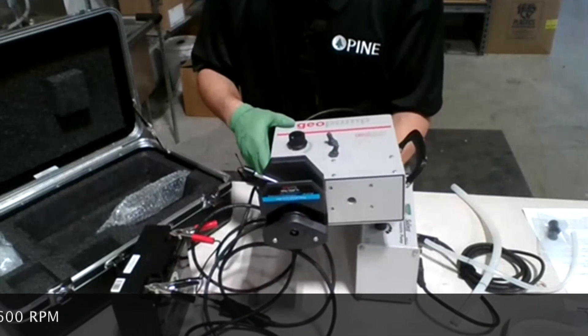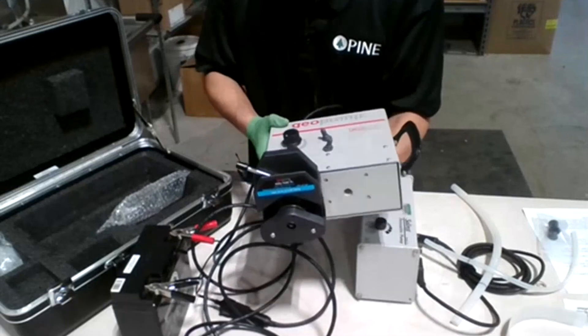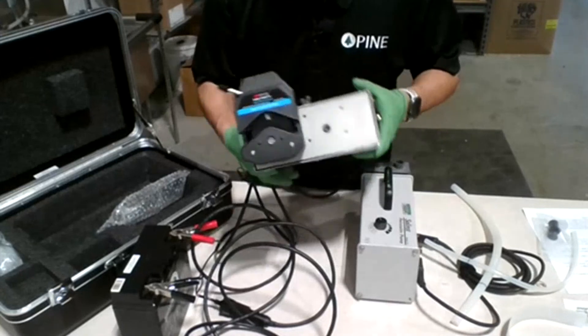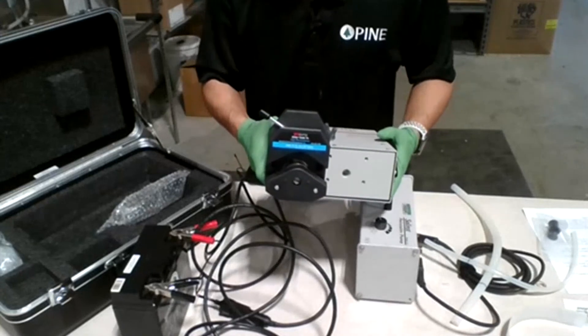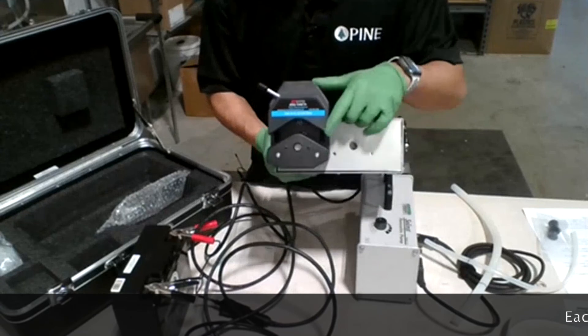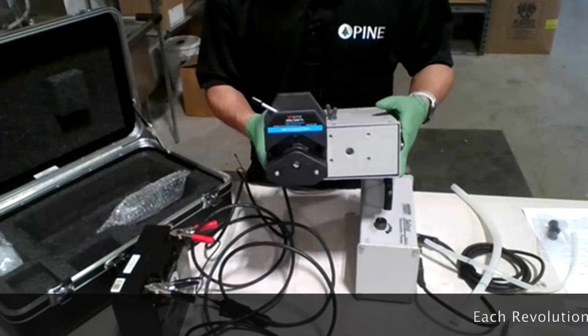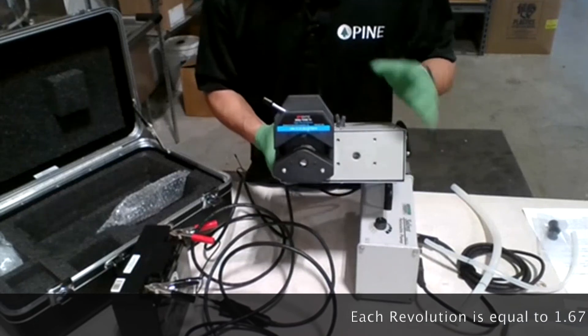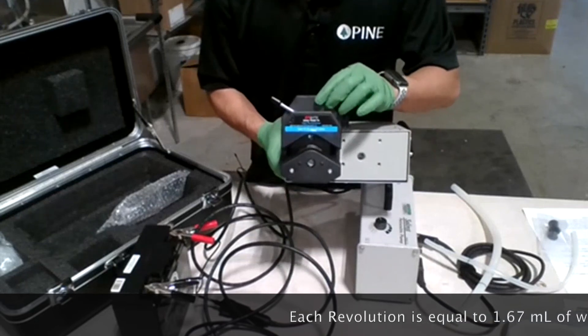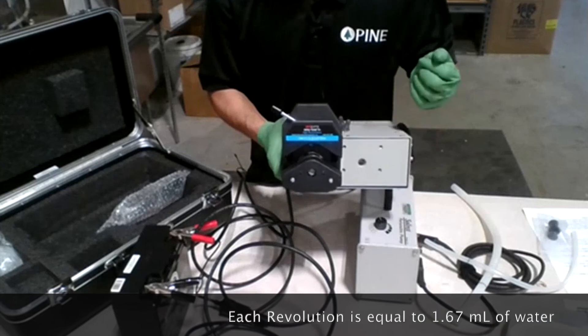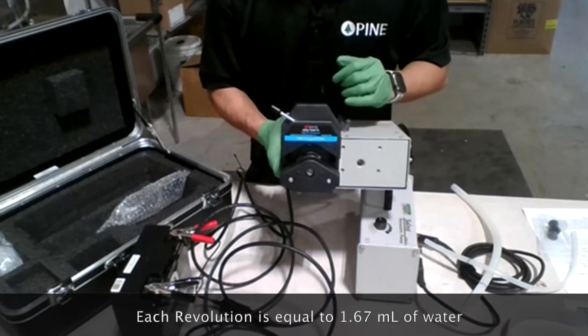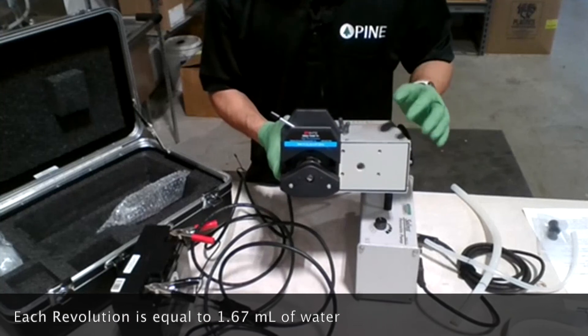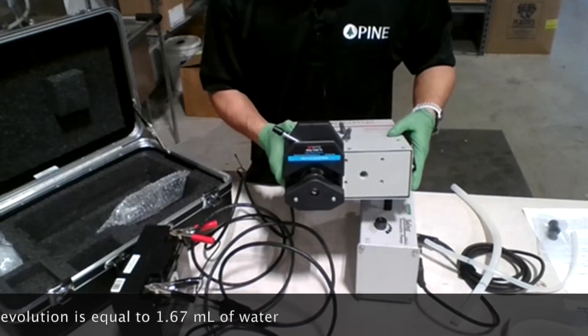Someone may ask how much volume can I get out of this one. Each revolution for the shaft here is equal to 1.67 milliliters. You can see how much flow you're pumping or drawing back by counting how many revolutions you have here.